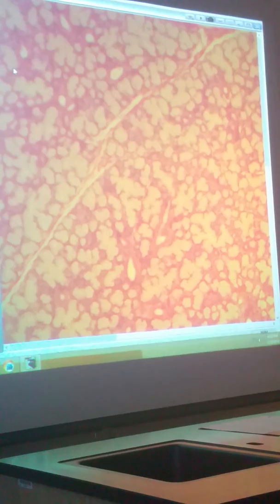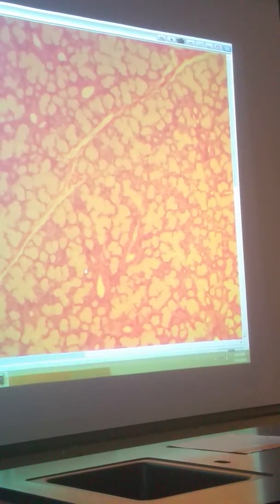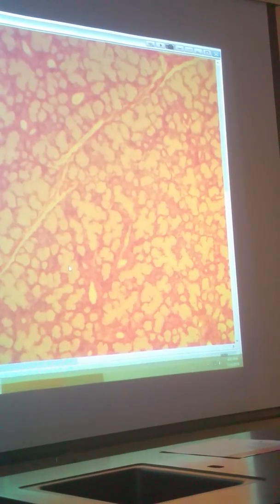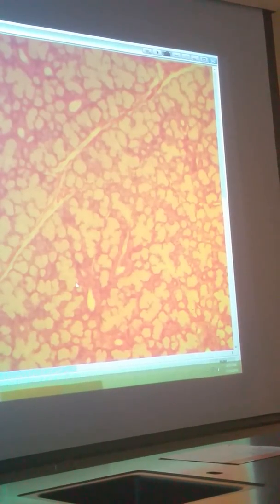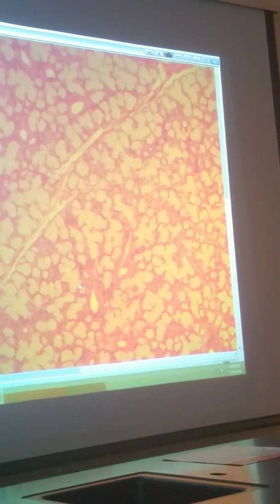Where would you point for cells of mucus acini? This right here, the whole thing, would be mucus acina. If I want to point at just one mucus acina cell, it would be this right here, so we put cell of the mucus acini. If you point in the middle, it's the general, the whole thing I'm talking about. But if you ask what cell this is, we would put cell of the mucus acini.